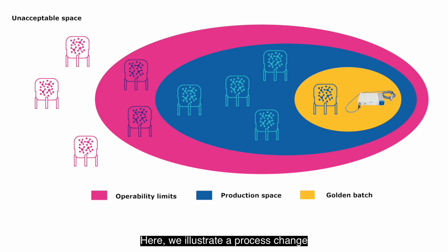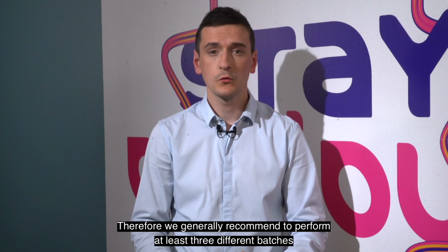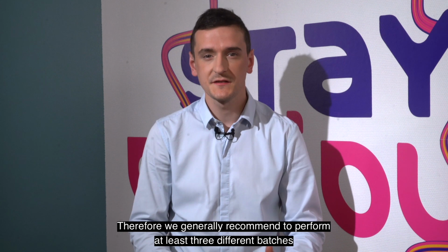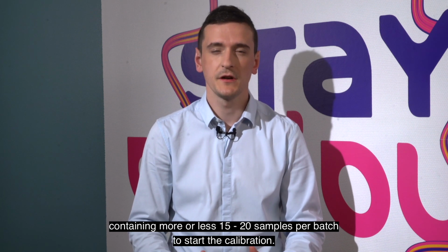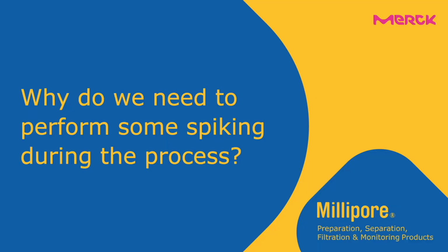Here, we illustrate a process change, meaning that if you try to measure another process with experimental conditions outside of the operability limits, then the model will not be able to monitor it with accuracy and consistency. Therefore, we generally recommend to perform at least 3 different batches containing more or less 15-20 samples per batch to start the calibration.